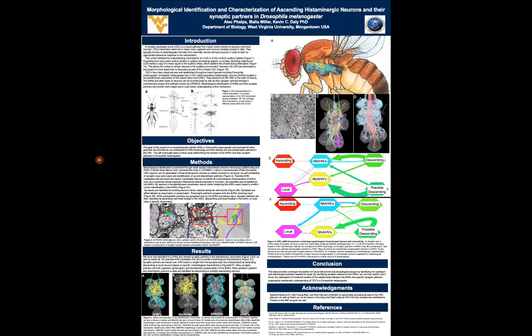Potential AHN candidates that are found are then traced. Candidates that do not exhibit all morphological characteristics, such as a corkscrew dorsal projection followed by lateral projection to the brain, are identified and annotated as not AHNs. Synapses are identified by locating electron-dense vesicles along the cell borders, which is shown in figure 2b by the red square. Synapses are either labeled as presynaptic or postsynaptic.